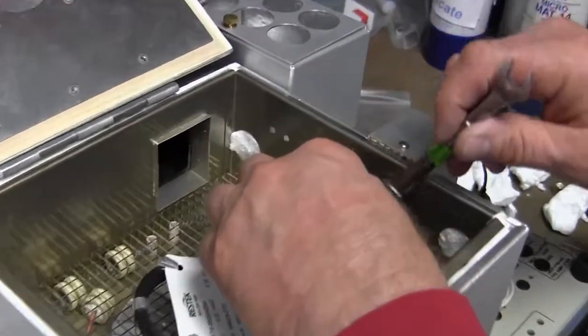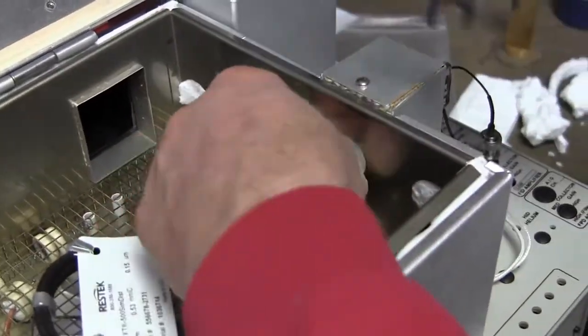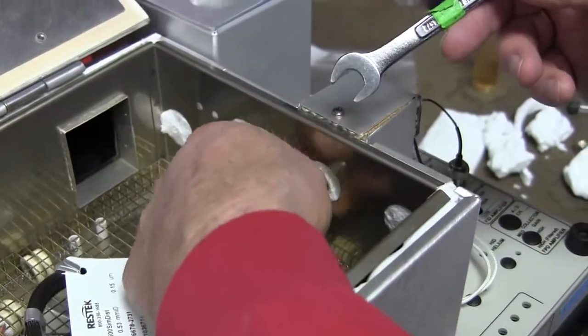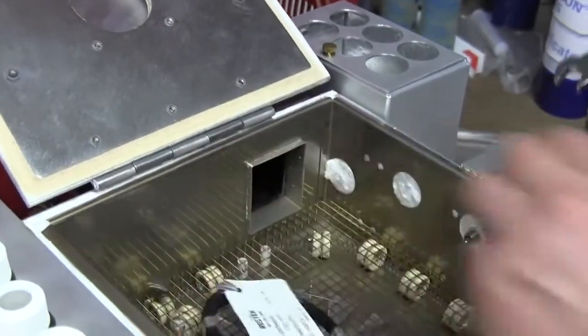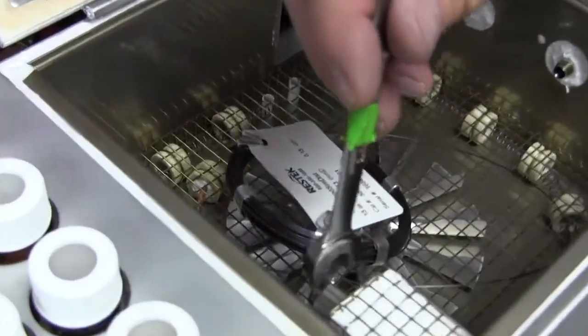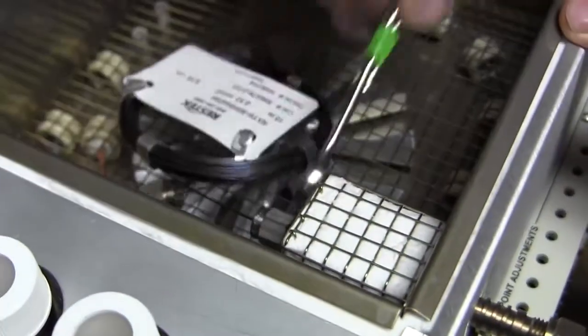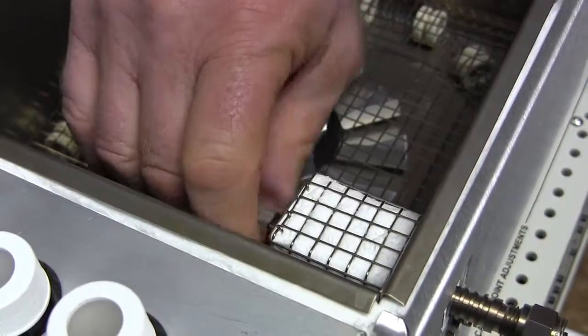So first, remove the column from the detector. Take a wrench, a 7-16 wrench, loosen the nut and the ferrule which hold the column in the FID detector. Same wrench, remove the nut holding the column in the heated injector.